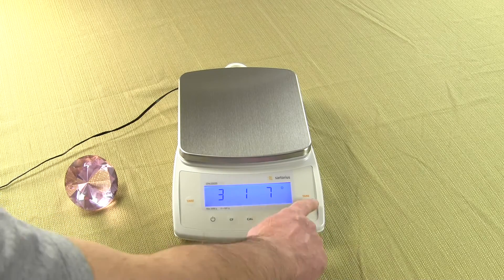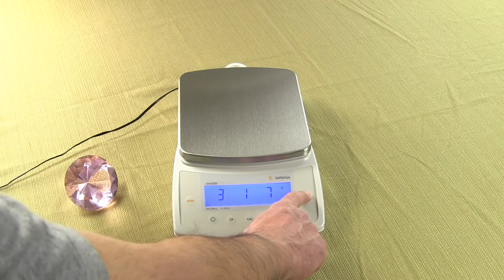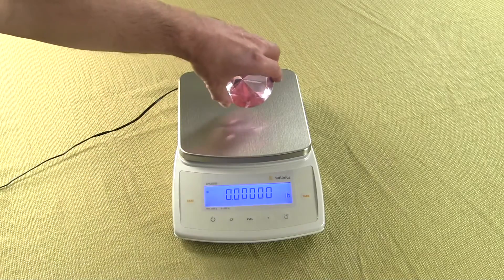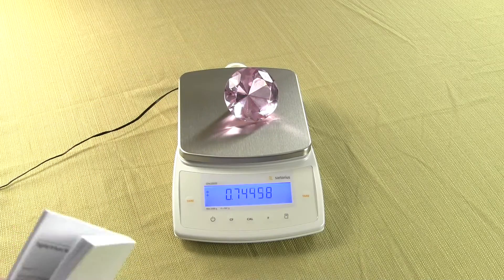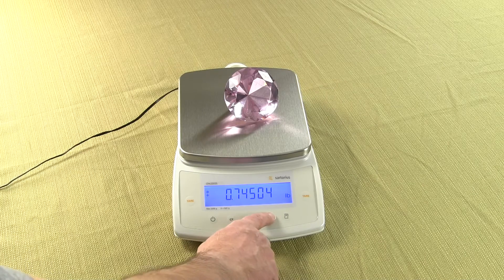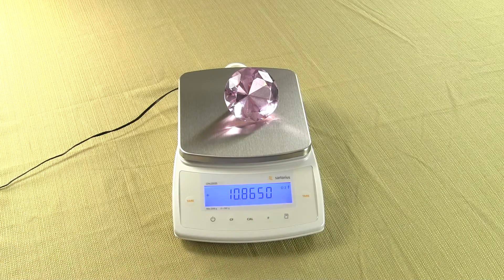We have 3, 1, 7. We want to reset the balance — press and hold the tare key. Now we have pounds as our primary mode, and if we press the F key, our secondary mode is now troy ounces.